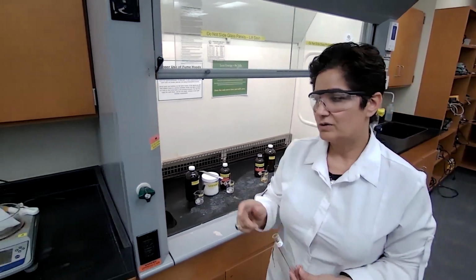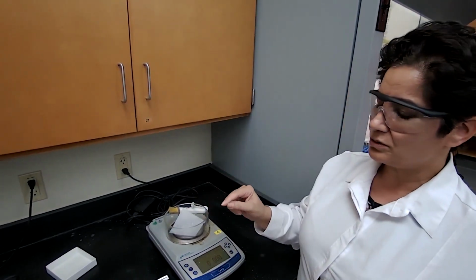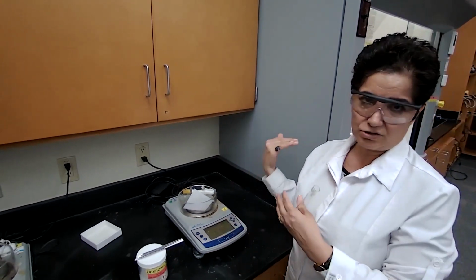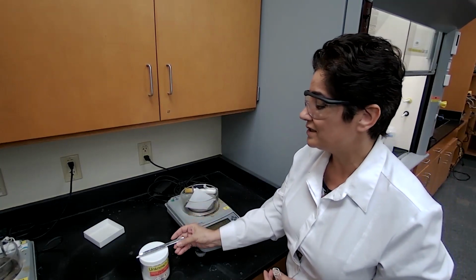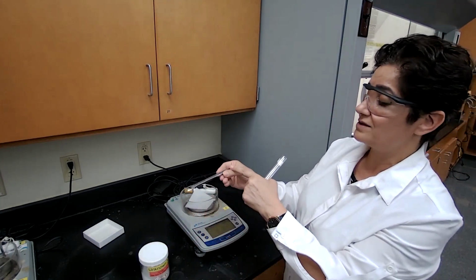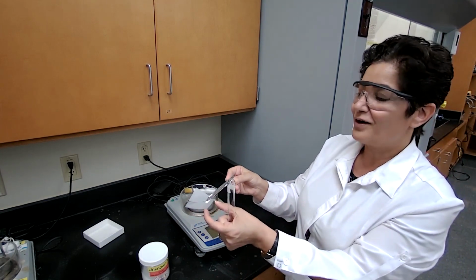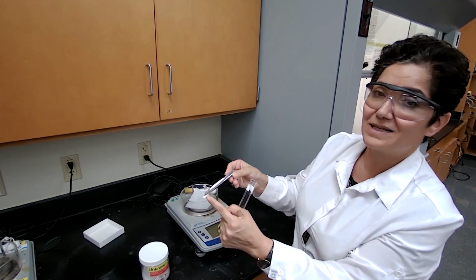So we are going to use about 0.1 gram of the sample. I just want to show you something because sometimes in the lab, I tell the students to use a tip of a spatula of the solid unknown, and just 3 to 4 drops of the liquid unknown. What is considered a tip of a spatula? The whole spatula, from here to the end, is not it. Same thing with a spoon: the stem of the spoon, you don't get food in there, you just get the spoonful of food. So halfway would be half a spatula. A tip of the spatula would be less than 1/3.